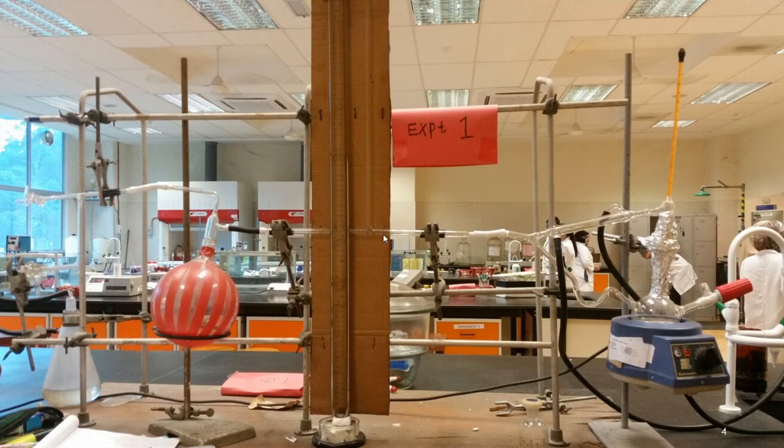It's a continuous experiment of increasing the pressure of the system and then getting the value of the new boiling point. If you get at least 8 to 10 points, that's good enough for you to start plotting. So there you go, our physical chemistry lab 2.